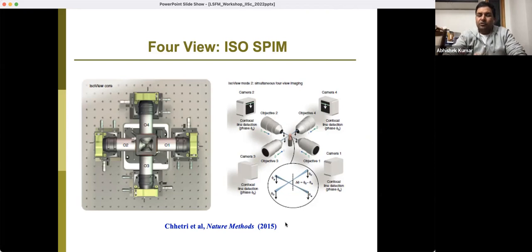And they have implemented autofocus and all, which helps as you go deeper and deeper. You don't keep your detection lens the same, you tune accordingly so that you can keep it in focus, because some of these samples are optically very inhomogeneous.